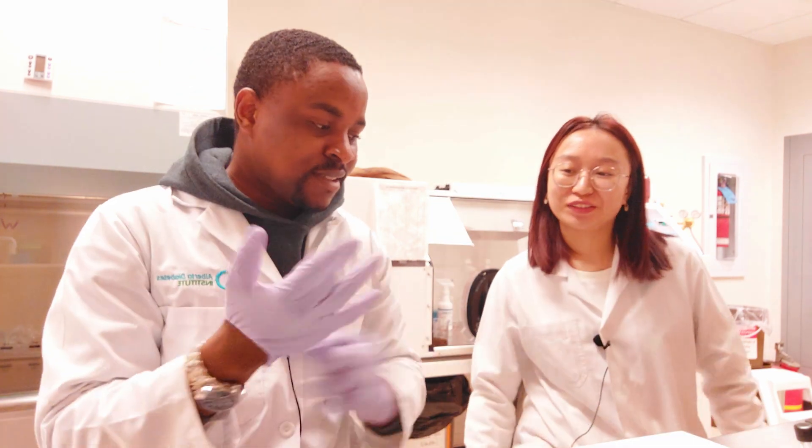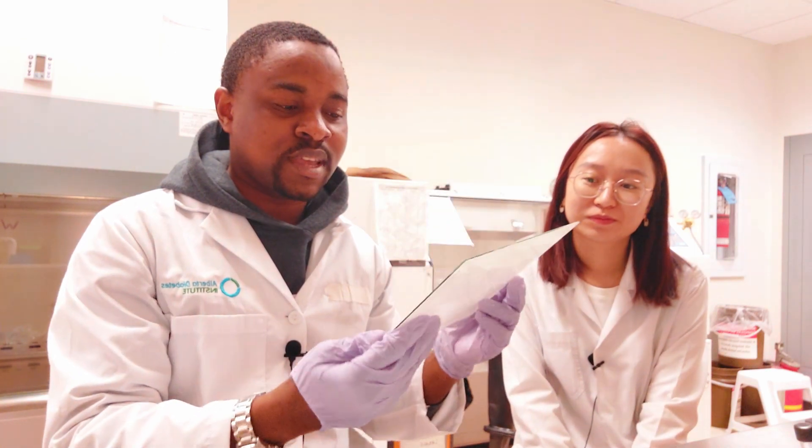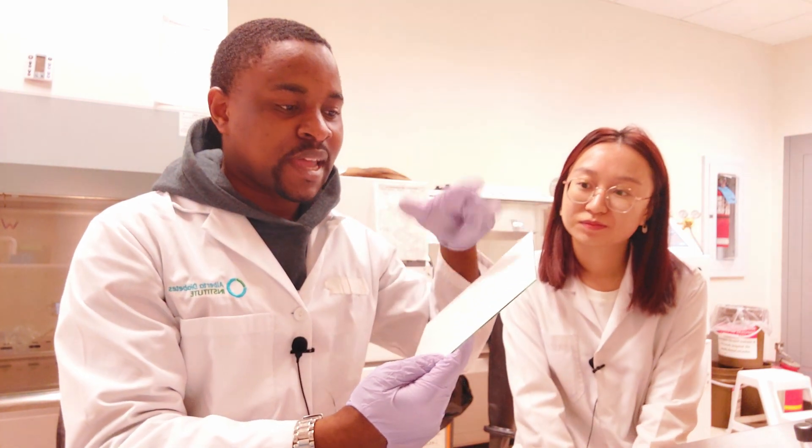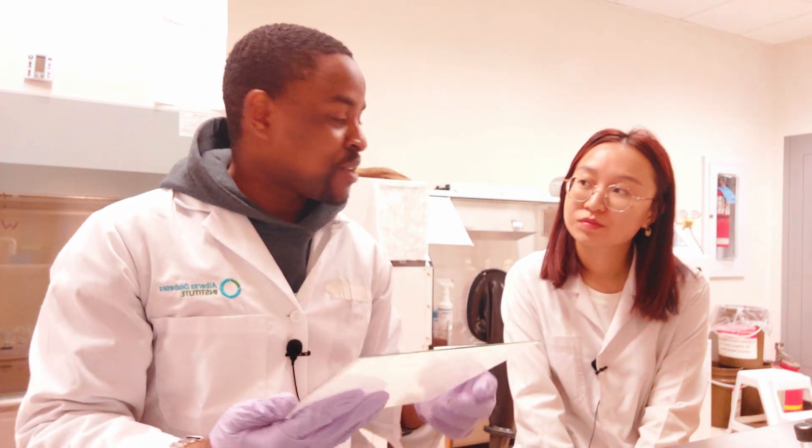There are a few things you need. You're definitely going to need a syringe, because that's what you'll use to do your spotting. This is the TLC plate, and we need to put a line across it before we actually do the spotting.